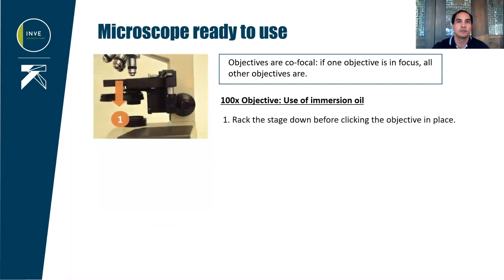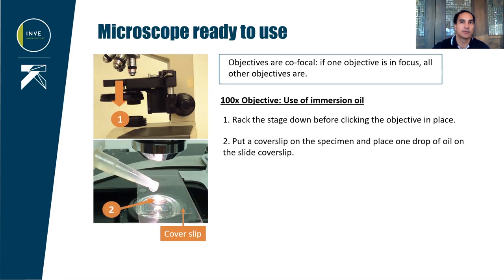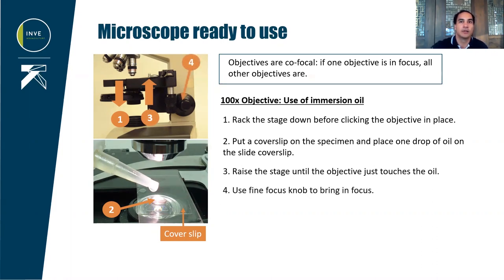To use immersion oil, first lower the stage down before clicking the objective in place. We are going to use a cover slip to avoid direct contact of the specimen with the objective lens. Place one drop of oil on the cover slip, then raise the stage so that the objective starts to touch the oil drop. From there, use the fine knob — the small knob in the center — to bring the area observed into focus. To avoid crushing the cover slip and damaging your sample or the objective lens, it is important to keep an eye on the bottom of the objective.